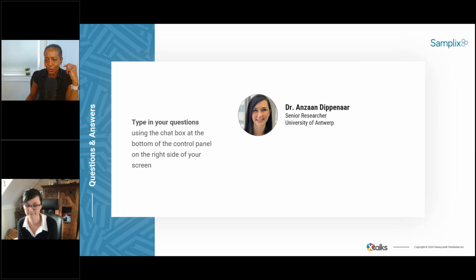Okay, I'm going to go to the next question now. Thank you very much for answering that. The next question we have here is, this audience member is asking, what are the main advantages and limitations of using different sequencing platforms like Oxford Nanopore technologies for tuberculosis genomics? What are your thoughts on that?